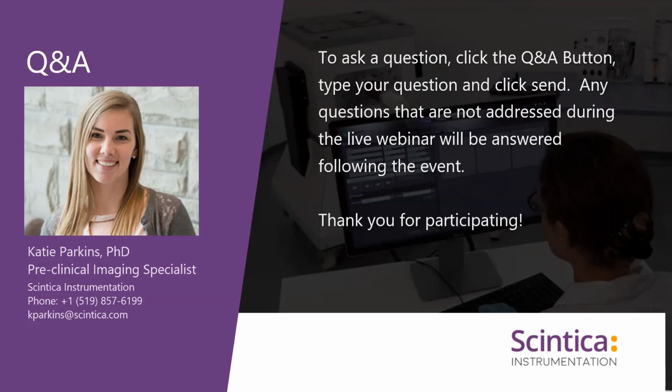Got it, thank you. And then continuing along the line of different organs, how does this type of imaging work on things that are moving, such as the lungs or the heart? Yeah, so the frame rate, the rodent hearts, they beat very fast. So it is not possible to image the beating heart. One cannot expect to look at the live beating heart, but you can do ex vivo imaging for the heart.